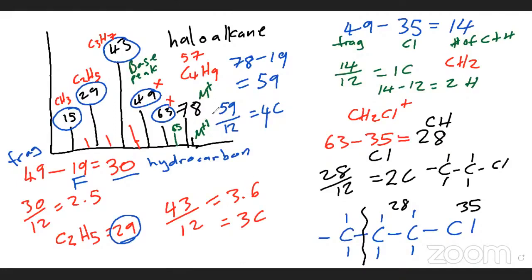Sir, why won't it be an M plus 2? Which isotope did they use for the 78, like the molecular mass? Which isotope of chlorine? Oh, it would have been 35. So won't it be an M plus 2 peak then, the small peak after the 78? Because 35 and 37, on the difference of two, you mean? Yeah. Sure, but could it not be a carbon isotope as well? It could be carbon 13.